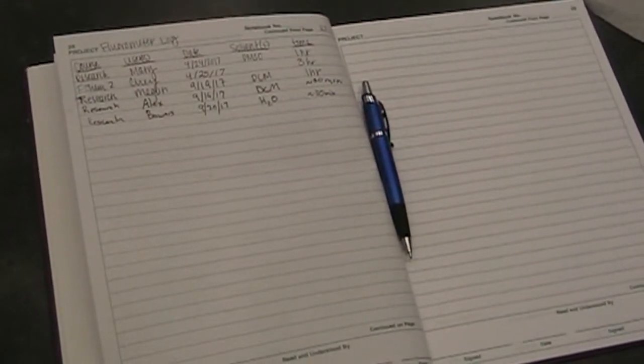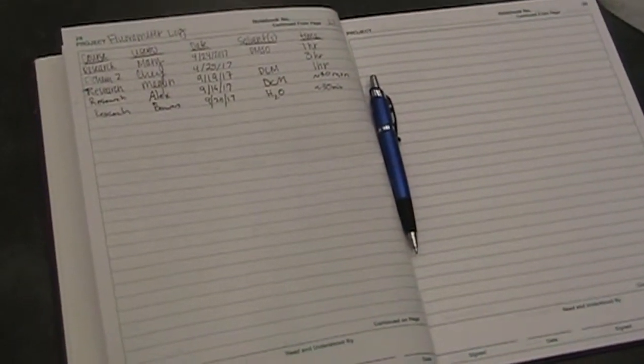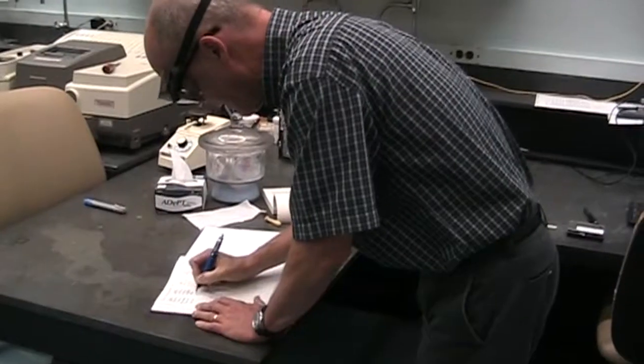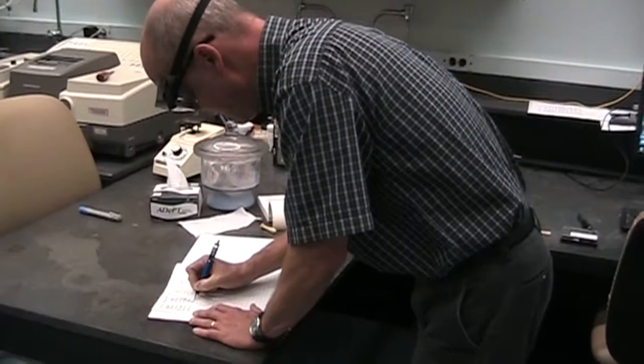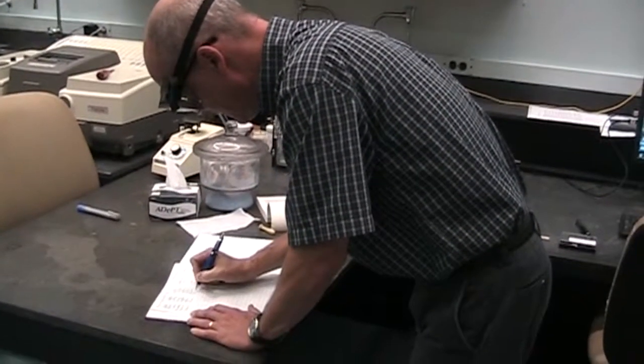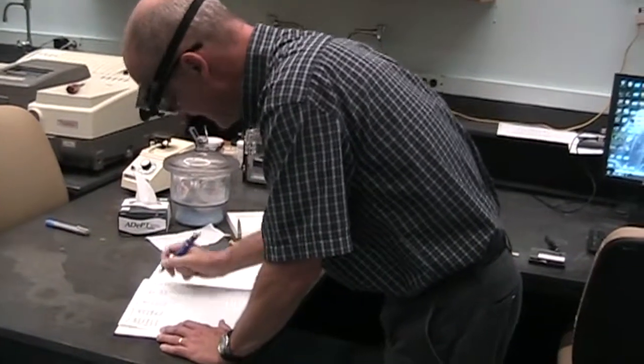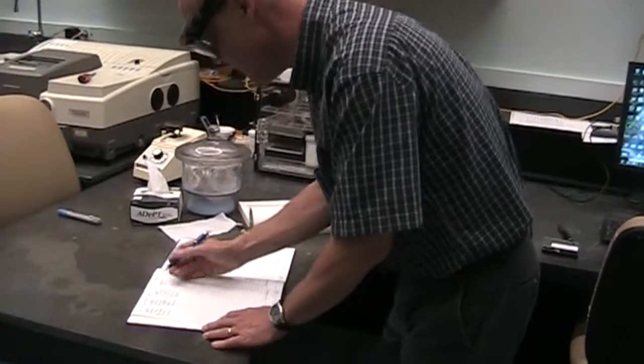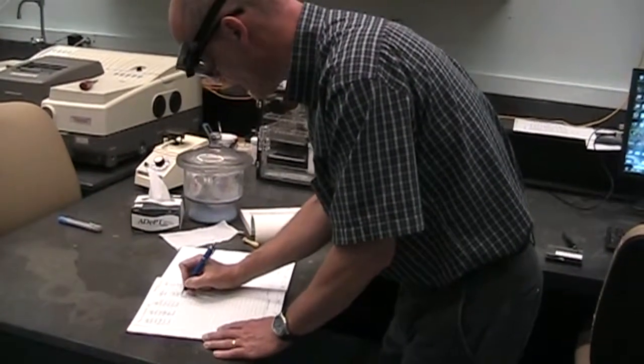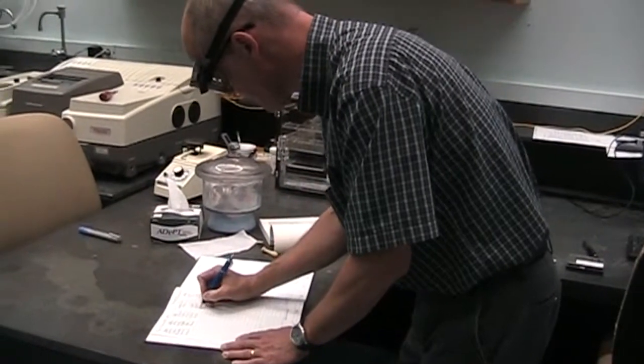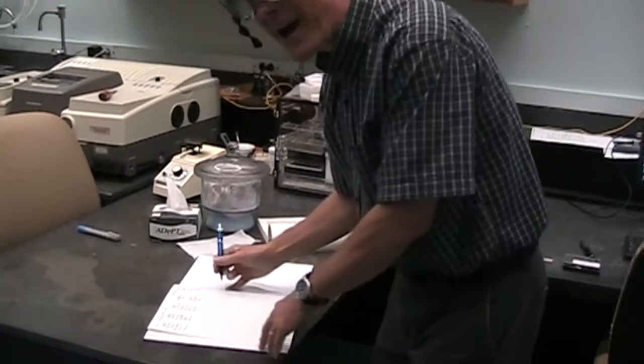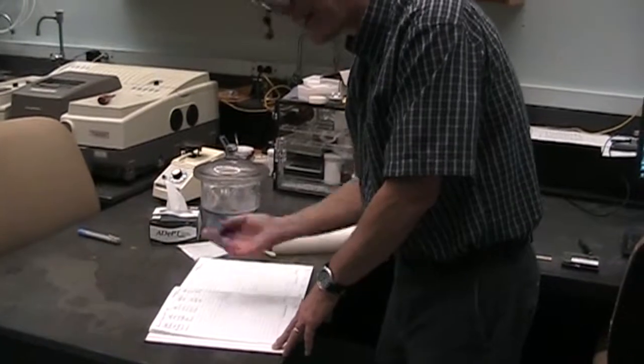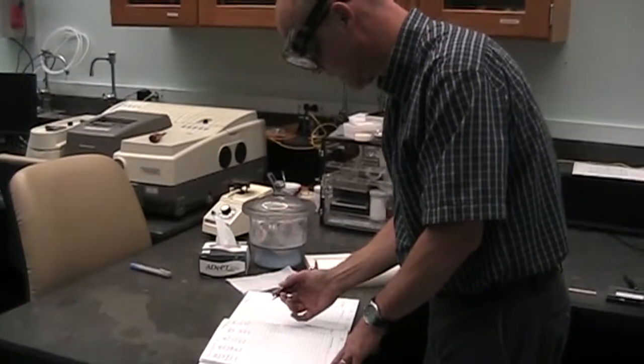You just put the purpose for today's experiment and your name, the date, and then any solvent, whatever solvent you're using. And then the amount of time—the lamps have a finite lifetime, so we do like to try to track their time.